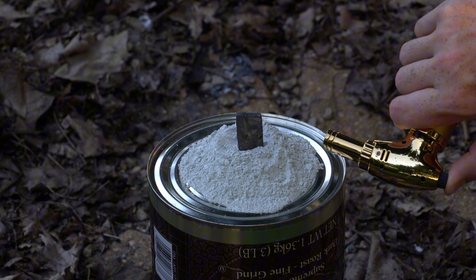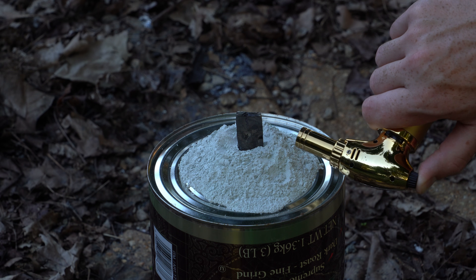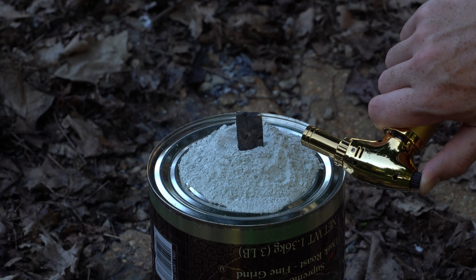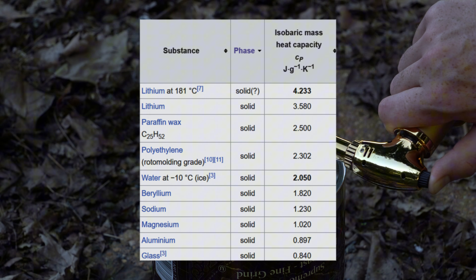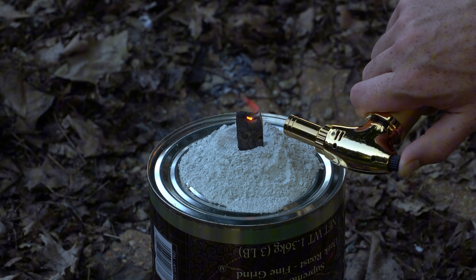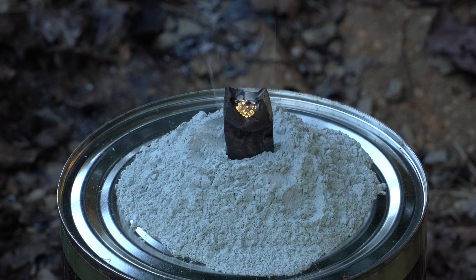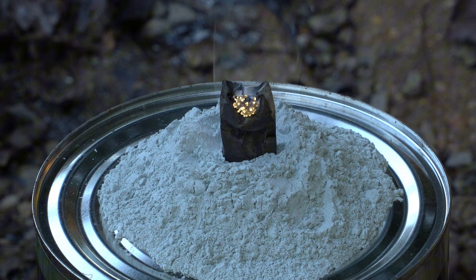Now all I have to do is light the lithium on fire in air, which is surprisingly hard to do for an alkali metal. It's worth remembering that lithium has the highest specific heat capacity of any solid phase material, and that's largely why I can torch it for what feels like forever before it finally becomes hot enough to ignite. Now you're looking at a pretty hot metal fire in air, but just wait until the reaction front makes its way to the abundant source of oxygen underneath.